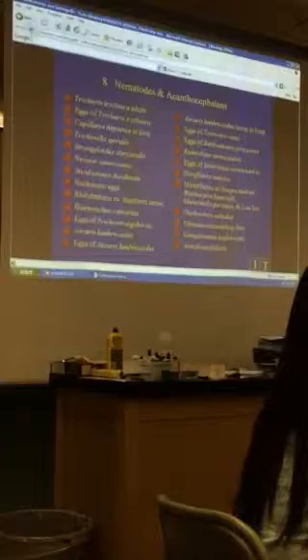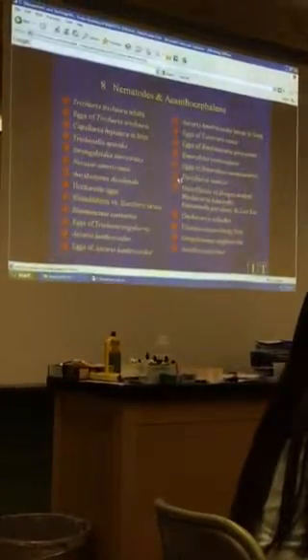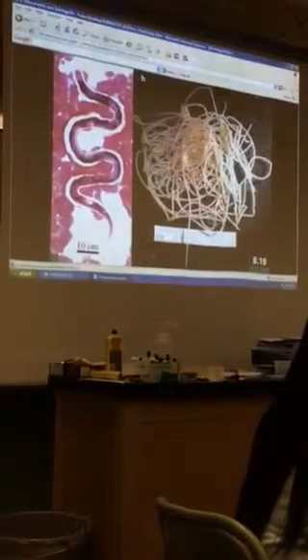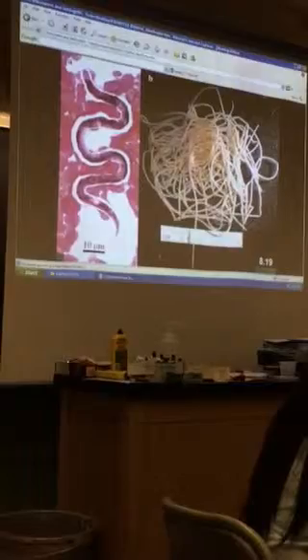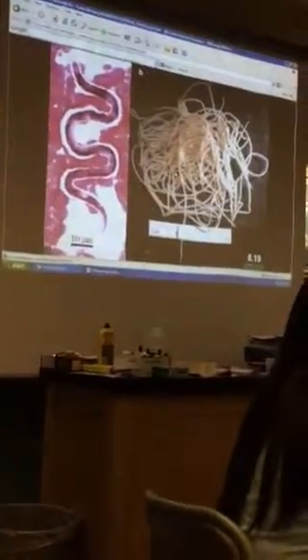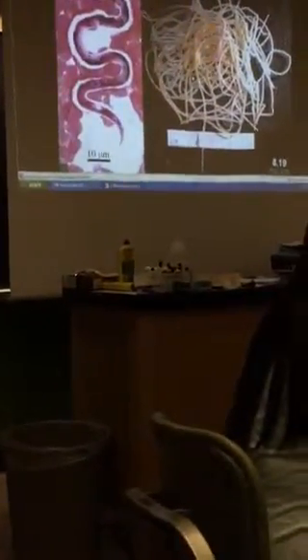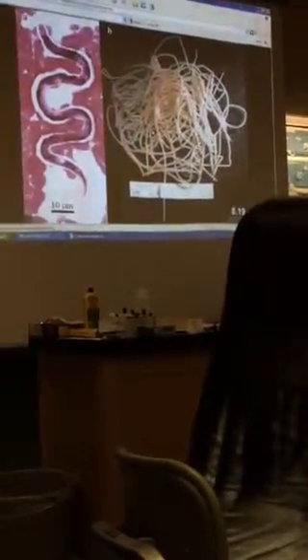Okay, and since we're going to talk about some of the filarial nematodes, Dirofilaria immitis is the dog heartworm. Maybe they got a picture of that. We got some in here. In fact, down there at the bottom where it says Dirofilaria immitis microfilaria, it's a stage. Add, write this down: adult in dog heart. Here's the adult in the dog heart. I always put it out, and then I put it on the test, and somebody says it's not on the list. Put it on the list.